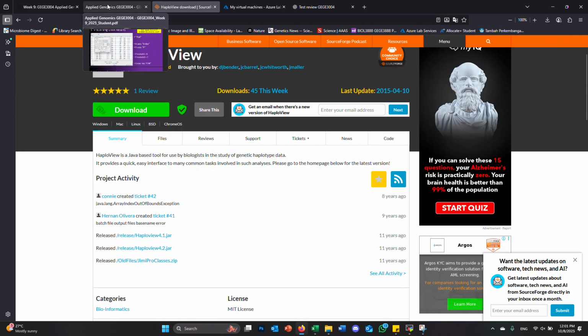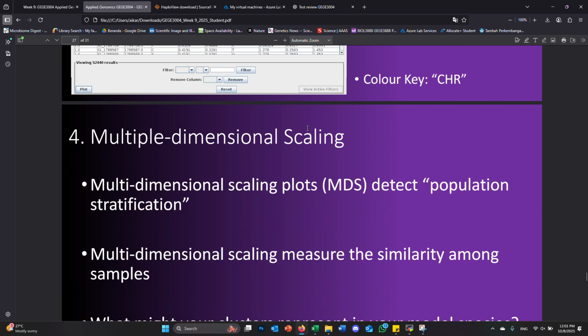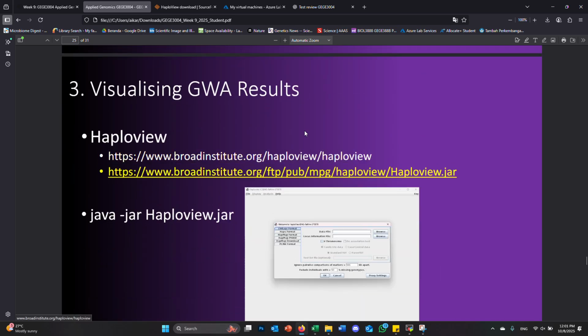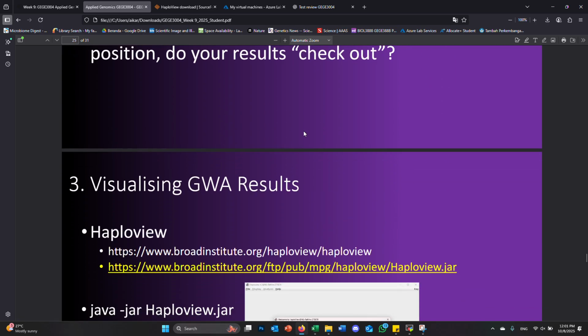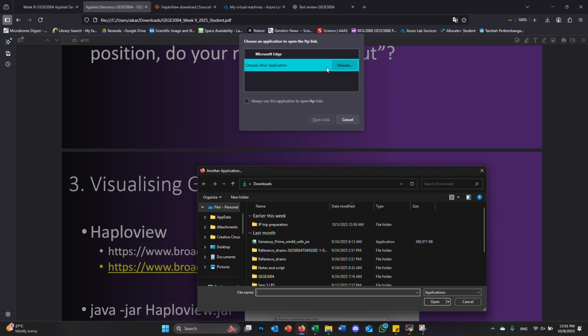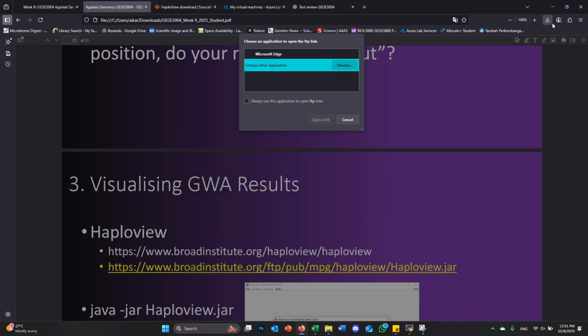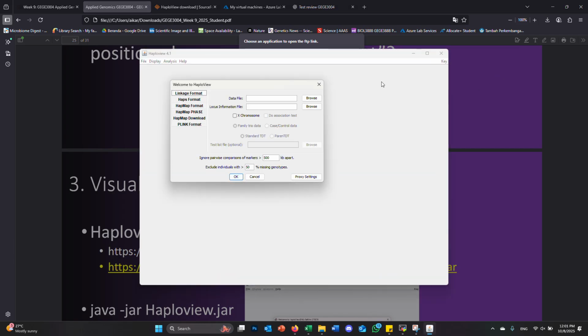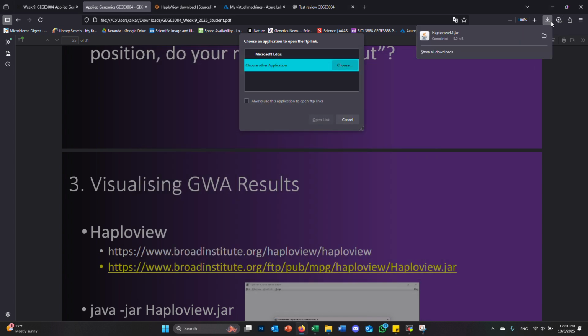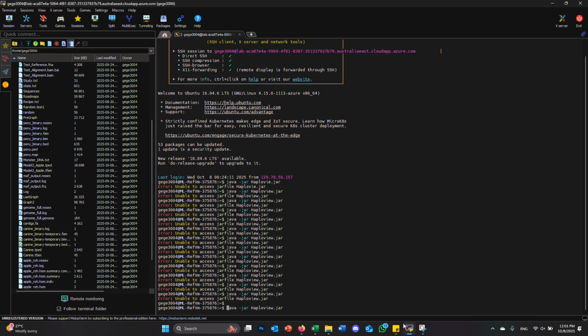You can leave the title blank if you want, or you can title it case versus control. For the x-axis, you want to select index. You might have to scroll to the bottom to find that. You want to leave the transformation box at default. For the y-axis, you want to select P, because we're charting the P values. And in the transformation menu, you want to select negative log, negative log 10 to be exact.